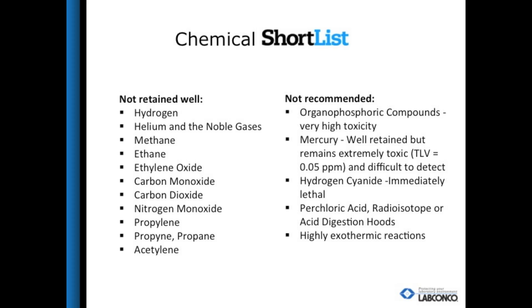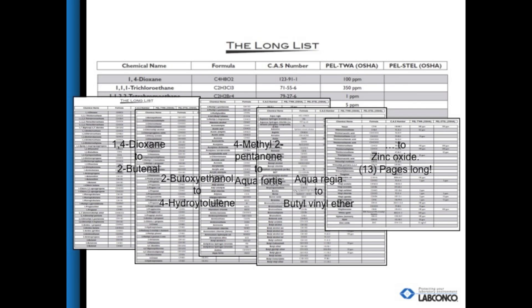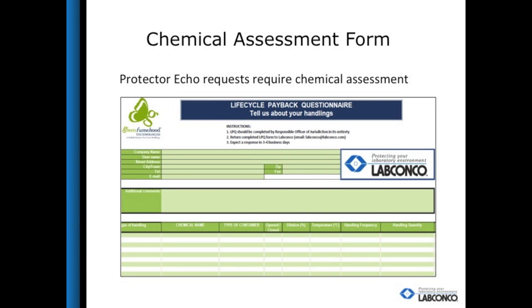This is the short list of chemicals which are not compatible with the Protector Echo. These are chemicals which are naturally gaseous under normal temperature and pressure conditions with a very low boiling point of under 25 degrees Celsius, and are not allowed for use in the Echo. The long list of chemicals that have been tested with Neutrodyne filtration and proven to work is 13 pages long, and is constantly being updated to expand the use of Neutrodyne filtration. Because we want to ensure safety for every Echo application, a chemical assessment form must be filled out prior to each order to make sure it is compatible with the filtration.